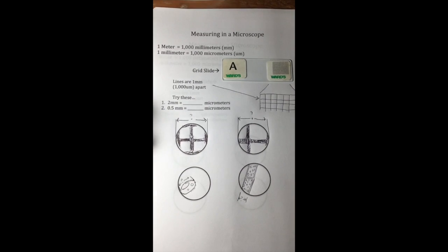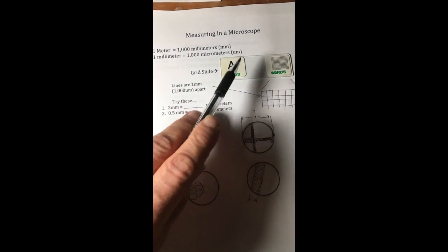Gottlieb. Okay, many of you are interested in measuring in the microscope, so here's how we do that. Measuring in the microscope.